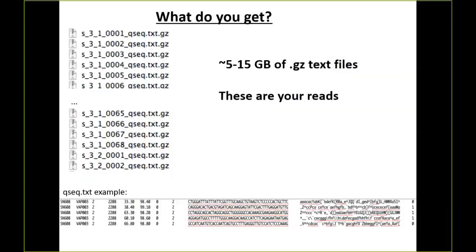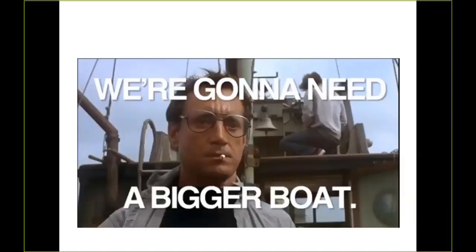All right, so what do you get back after you do your sequencing? Well, you get back a lot of data. So again, storage needs for labs doing a lot of sequencing are not to be underestimated.